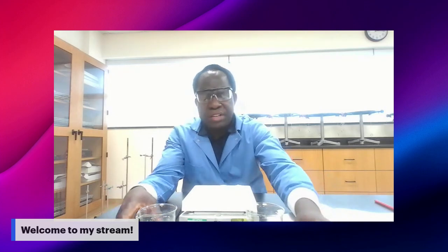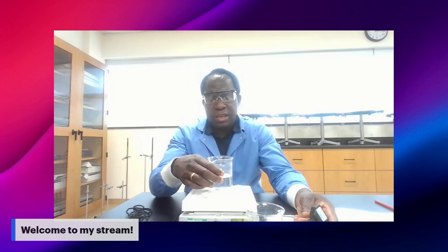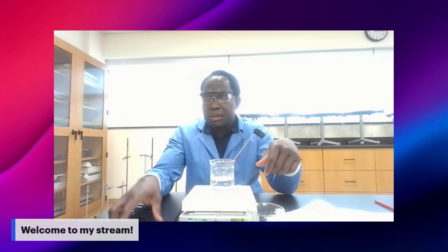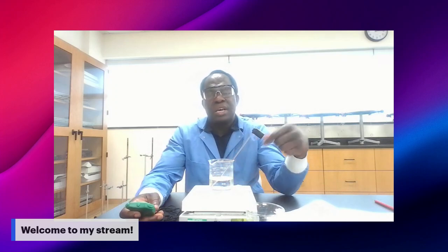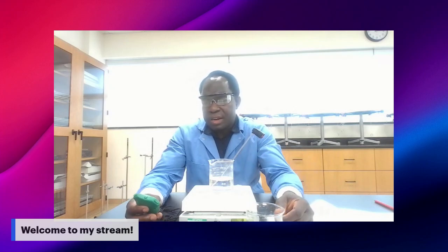One thing to remind you is when you start, this is how it should look. This is my water here, with the thermometer inside. As soon as you put the beaker containing the water on the hot plate, you need to start the timer. And every 15 seconds, look at the temperature. As soon as you put it on, that's 0 seconds. You should take the temperature and then you start from there. Same thing for the alcohol too.